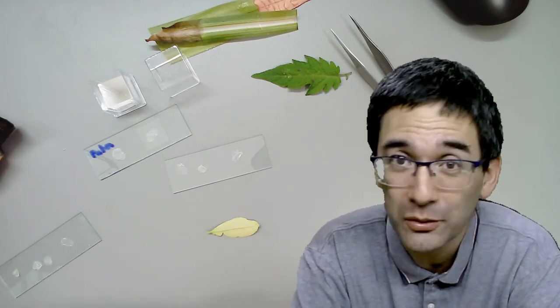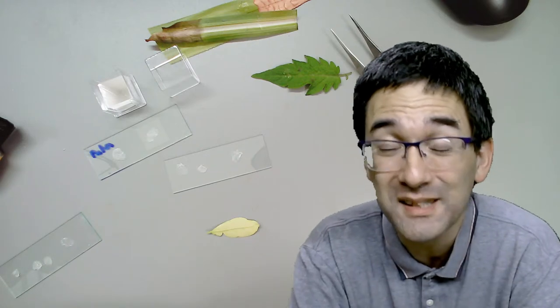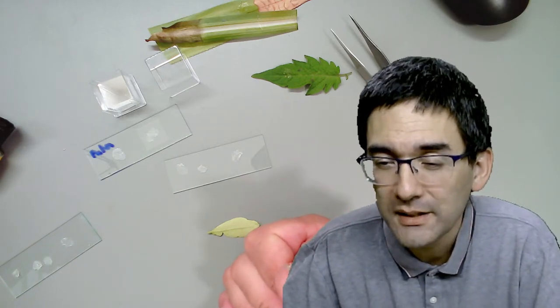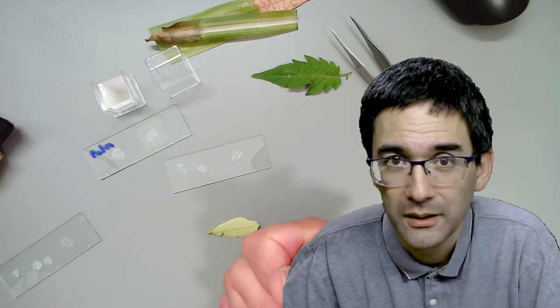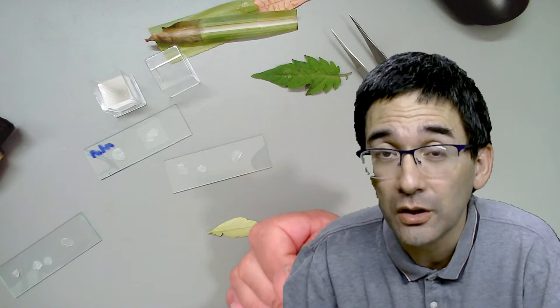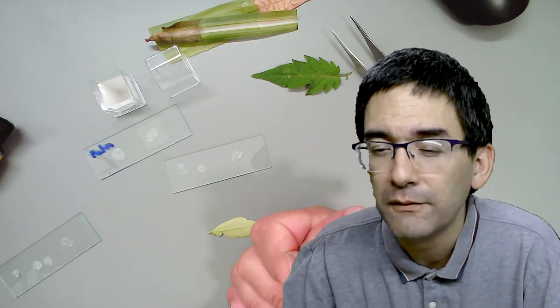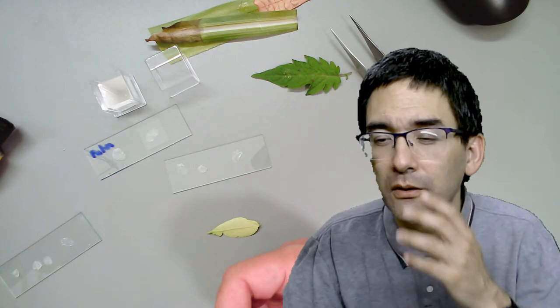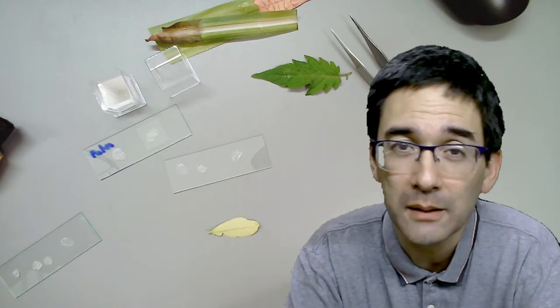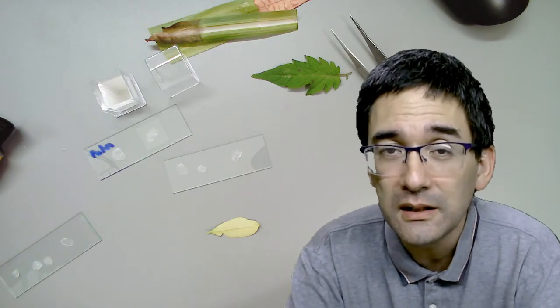Even simple stains and immersion oils became more and more difficult to buy - there seems to be some kind of a new law concerning the sending of chemicals. My suggestion is to maybe find chemical companies that supply those, or contact insect researchers because they use Euparal as well. I found a shop in Germany but they don't deliver to the Netherlands, and some shops don't even want to deliver to private people.